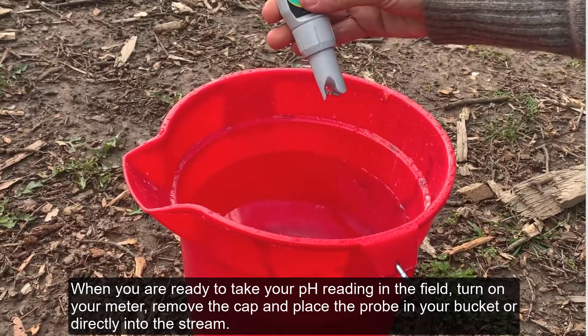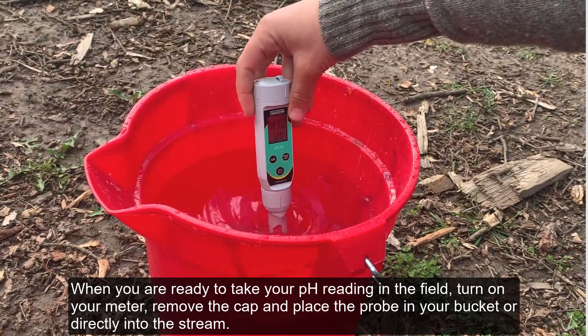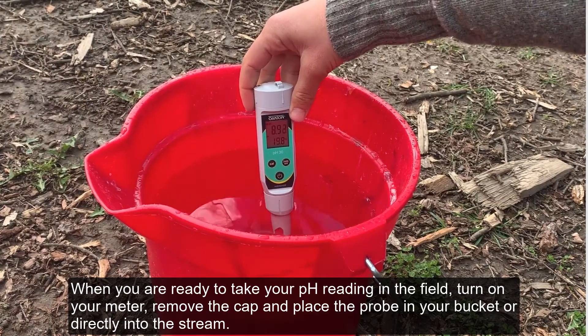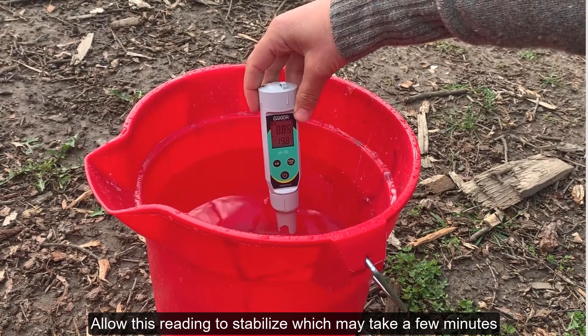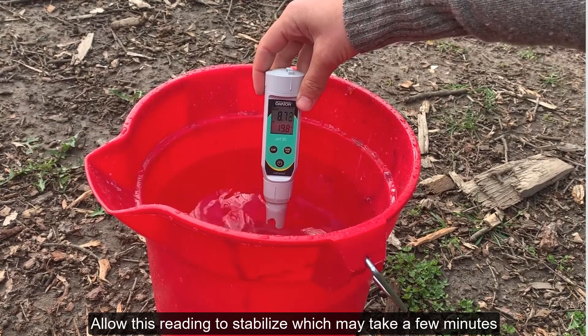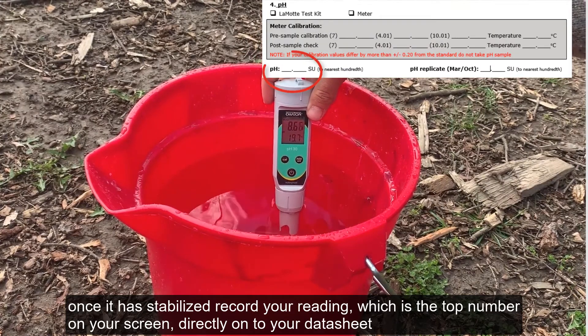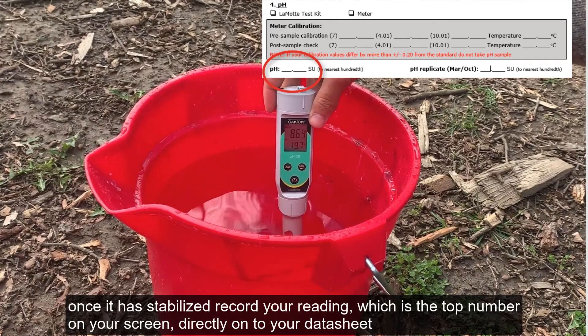When you are ready to take your pH reading in the field, turn your meter on, remove the cap, and place the probe in your bucket or directly into the stream. Allow this reading to stabilize, which may take a few minutes. Once it is stabilized, record your reading — which is the top number on your screen — directly on your datasheet.